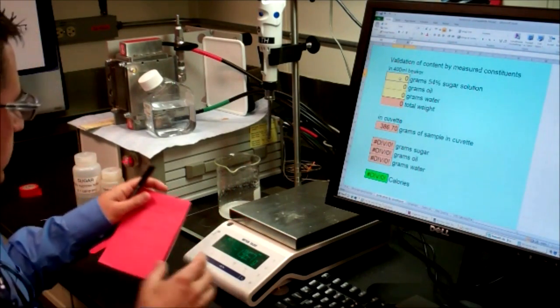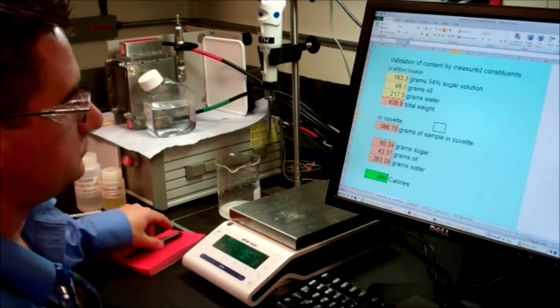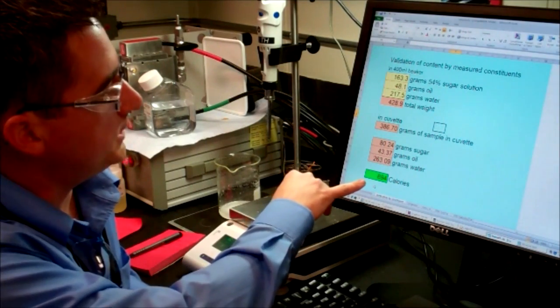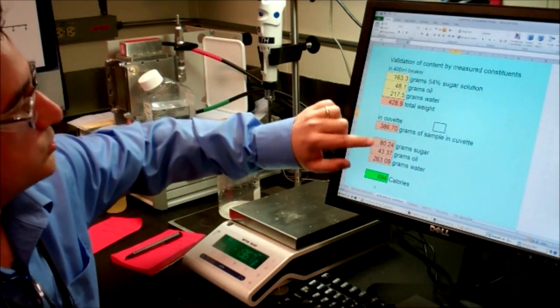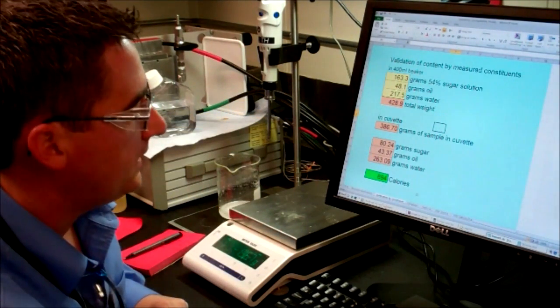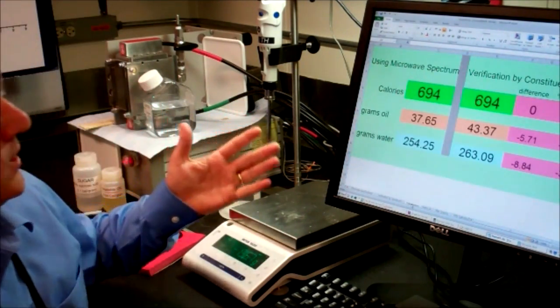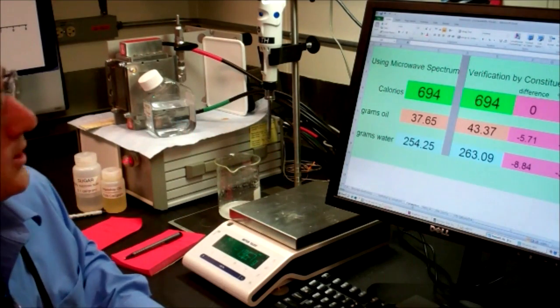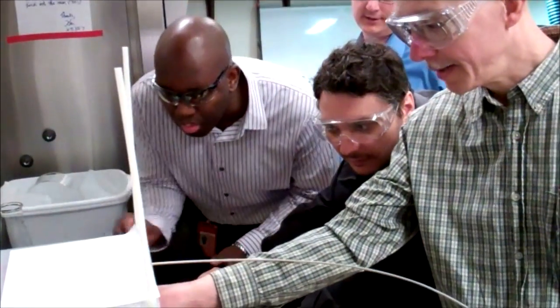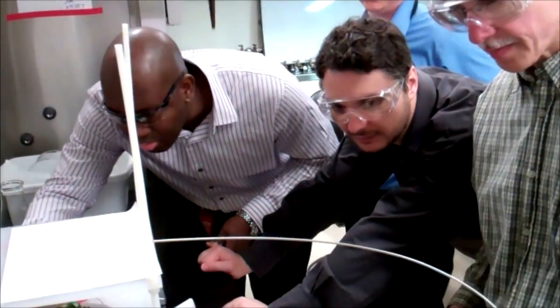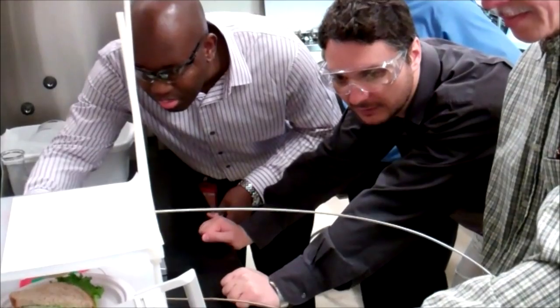Now we're going to put in those numbers that we put into the beaker. You can see here we get an estimate of 694 calories. That's what we put in the beaker, and then it tells us how much we actually poured into that cuvette. And then what we have is a comparison where we can see we're exactly on, which is a rare occurrence. Webster says they have done this experiment 40 to 50 times and are always within 5 to 10 percent of the target calorie count.